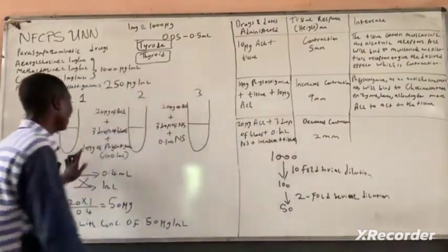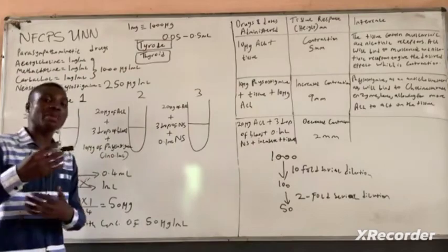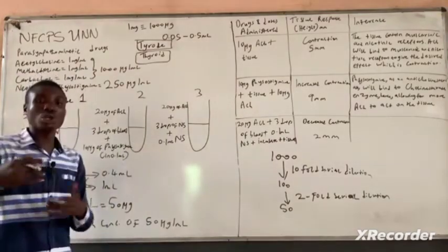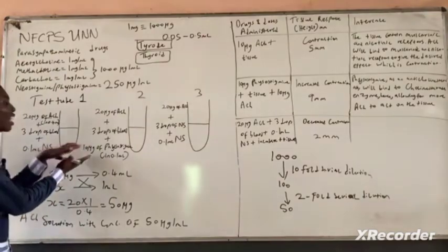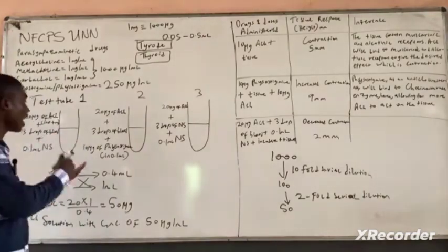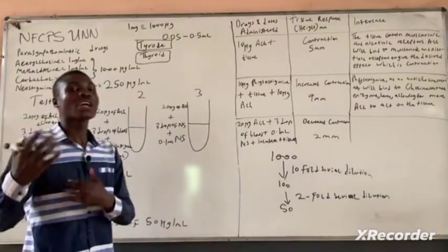It will help you to understand that the 10 microgram of physostigmine, we don't need to dilute again because we already have a 100 microgram per ml solution of physostigmine that we can withdraw 0.1 ml from, that contains the amount of 10 microgram of physostigmine. Now, what is physostigmine? An anticholinesterase.